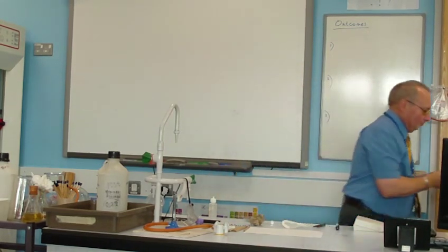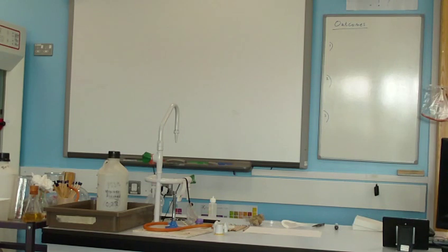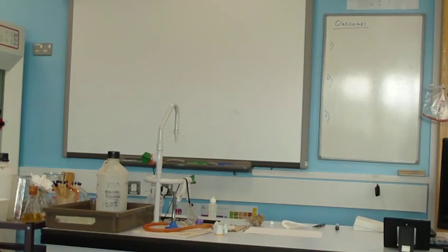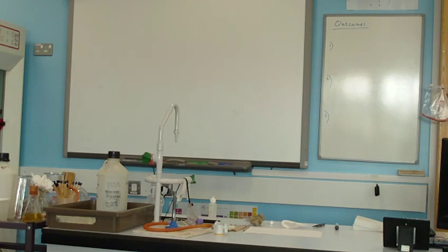Now, you'll need one of these tubes. This has got an acid in, so you have to be very careful, and you put it in the rack.